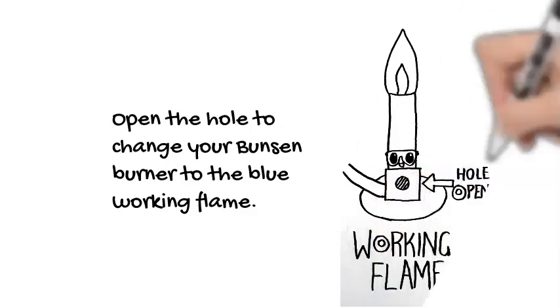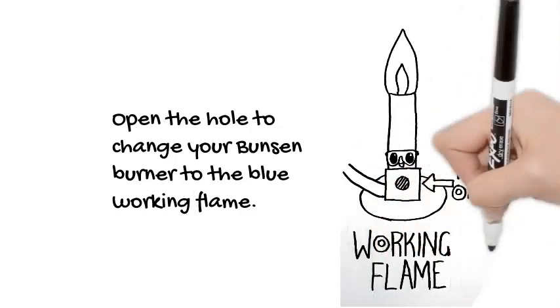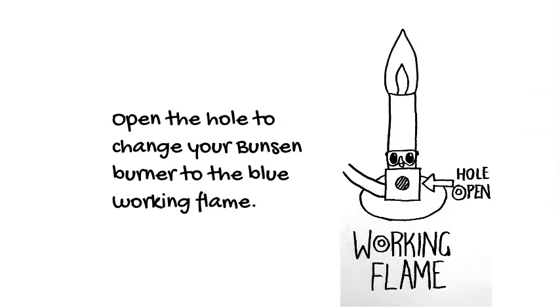Which makes sense. We know that fire needs oxygen to burn. Opening the air hole lets in more oxygen, which allows the flame to burn hotter.